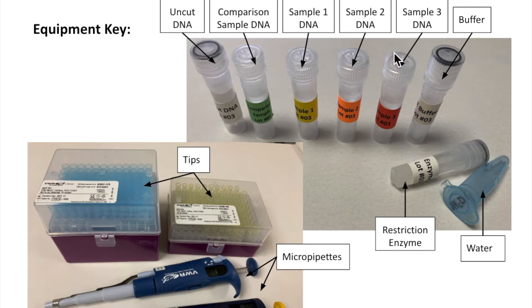Each of these tubes has DNA in them. The comparison sample is the DNA we got from the hair and saliva left in the Takis bag. This tube is labeled CS. Sample 1 has Paul's DNA and is labeled S1. Sample 2 is Devante's DNA, and Sample 3 contains Lucia's DNA labeled S3. This is our control and is DNA that will not be cut by the Restriction Enzyme. It is uncut DNA labeled U.